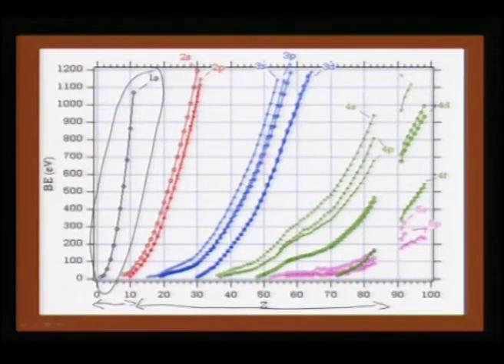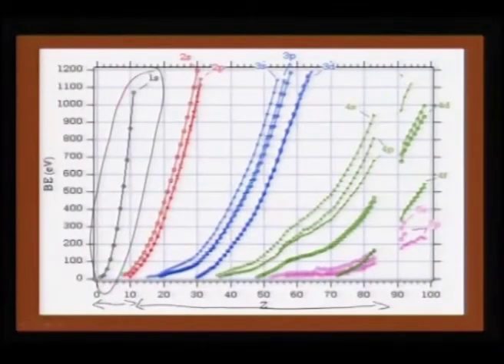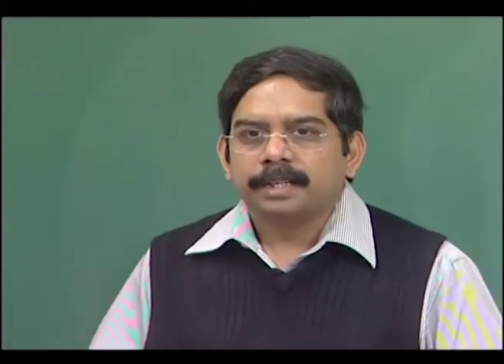So, each number will have a very precise count. So, there will not be any change, and therefore, we can easily try to analyze the local state of each of this metal or elements. But when you go to higher energies, as you can see here, there are some gaps for 4f and for 4d electrons, mainly coming because of the heavier electrons and the screening and the penetration effect, which will actually distort the way the Aufbau principle describes.